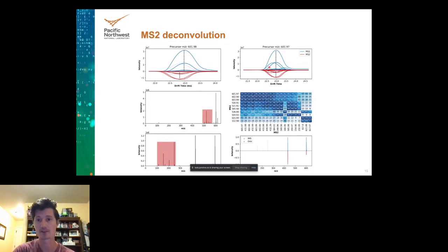So what we can do is take the pairwise correlation after correcting for the MS2 offset of the MS1 and MS2, and then filter these out based on how well they correlate. Based on this matrix here, you can see that we kept the dark blue down below and filtered out the light blue, faded away into the distance, and compared against an acquisition by targeted Orbitrap. And it turns out we picked up the same fragments, albeit at slightly different intensities, but that's to be expected, as the collision energy applied wouldn't necessarily be identical, despite trying to make them as equal as possible.